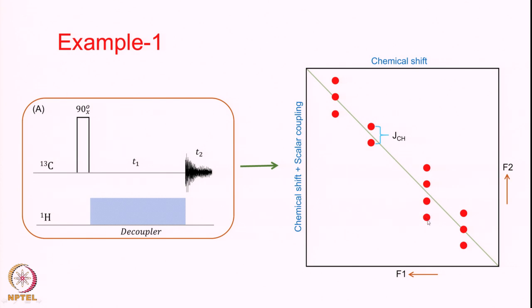So if we were to take a cross section here like this, then it will be a quartet of the CH3 group. How does it look? Let us just try and draw it here. A triplet, if we were to take a cross section here, will look like this. And if I were to take a cross section here, it will be a quartet. The center is here, this is the chemical shift position. Likewise this one will be a doublet, with the chemical shift position in the middle, and the last one will be a triplet again.